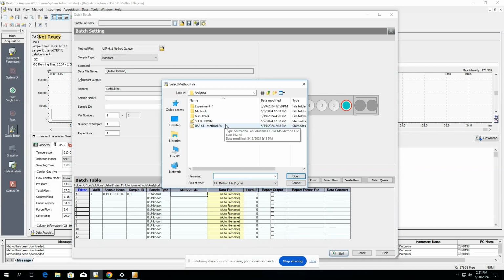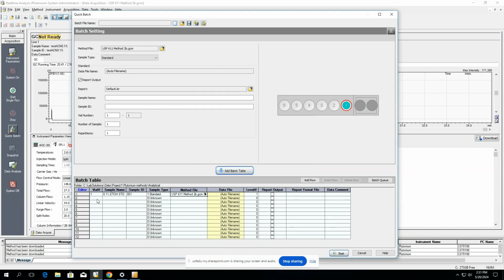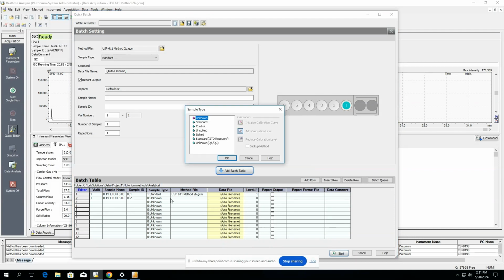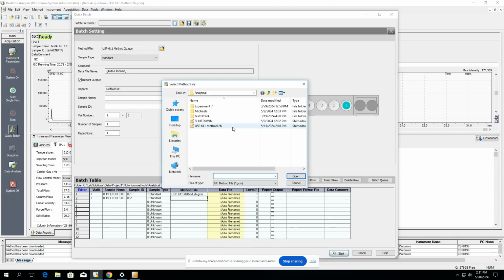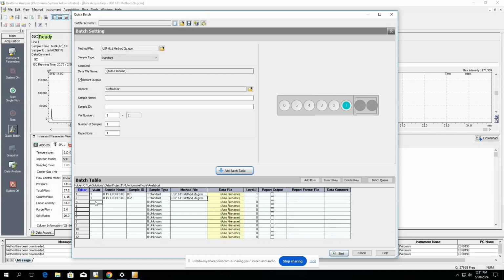which vial. So make sure that you select the desired method for each vial. This is how the vial is going to be measured. So all of the parameters that were set in the method file are going to be chosen during each injection. So the first 2 lines are going to be 2 repeated injections of the first vial. And this is an example of the first injection will be used as a conditioning injection, so the column can get more used to seeing that analyte. And then we're going to omit that first peak, that first injection, and just look at the second injection.